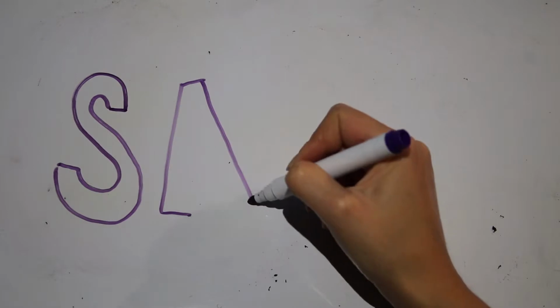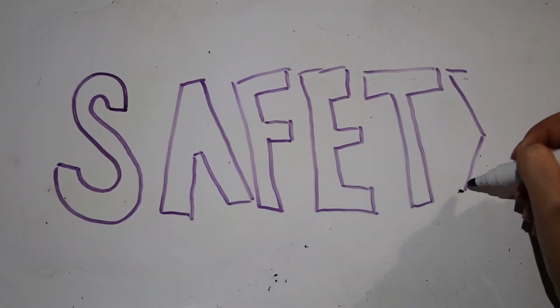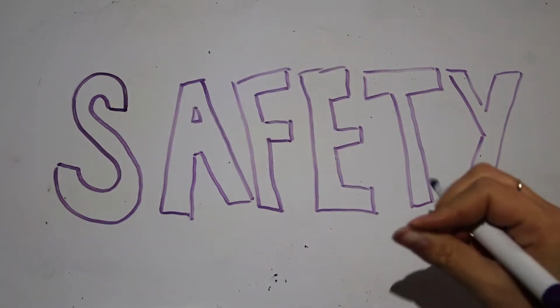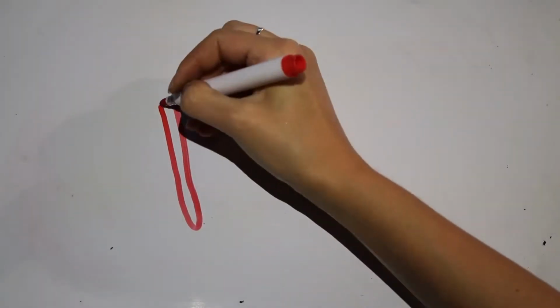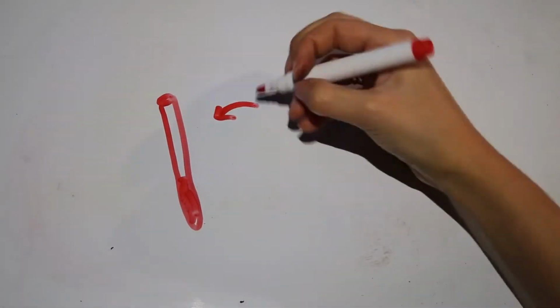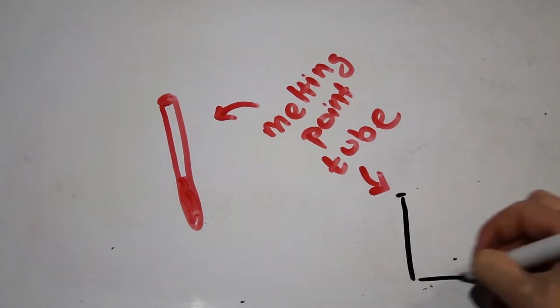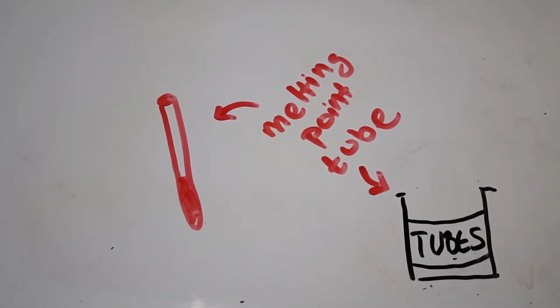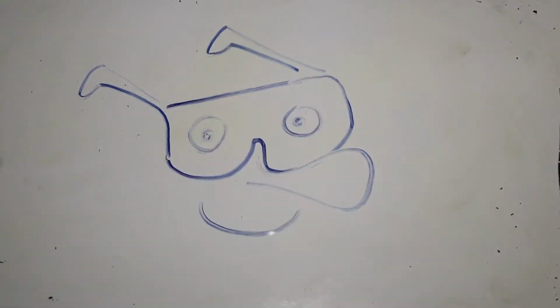This is a rather foolproof experiment when it comes to safety, but as always, safety must never be overlooked. So have the following things at the forefront of your mind throughout the entire practical. Do not leave used melting point tubes on benches. Instead, dispose of them in the designated labelled beakers. Always wear goggles whilst inside the lab.